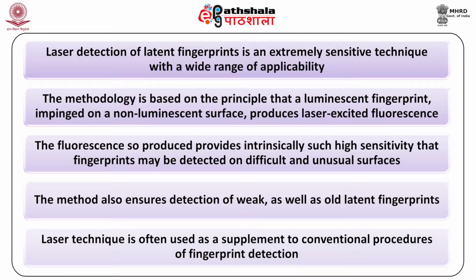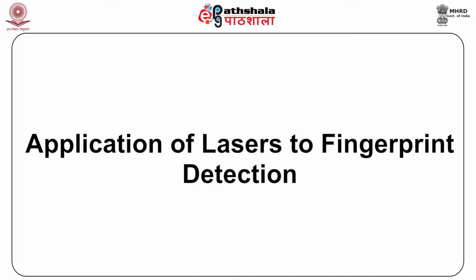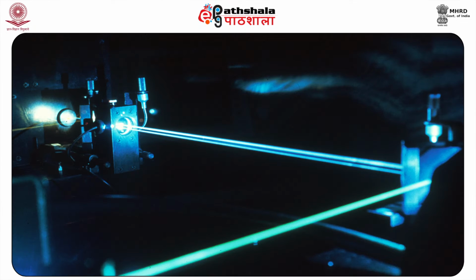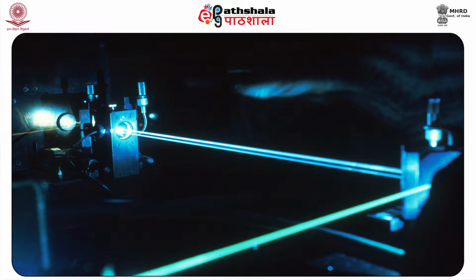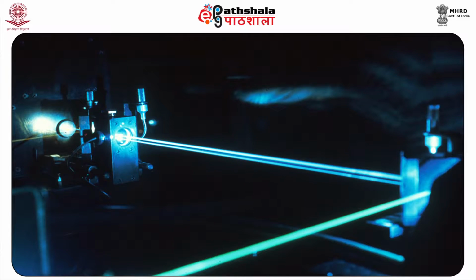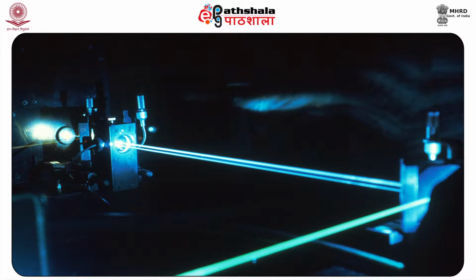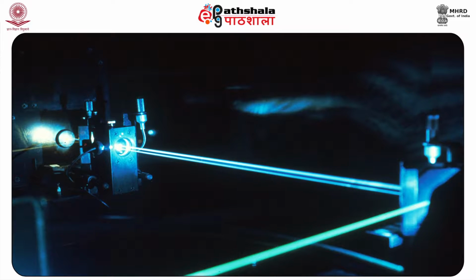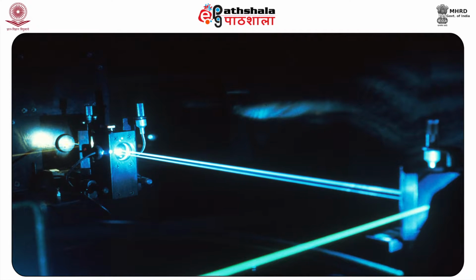Laser technique is often used as a supplement to conventional procedures of fingerprint detection. Let us now have a look on application of lasers to fingerprint detection. The most common device used for the detection of latent fingerprints on difficult surfaces is the argon laser. The surface impinged with the finger mark is illuminated with the blue-green beam from the argon laser. Before it strikes the surface, the beam is made to pass through a lens.